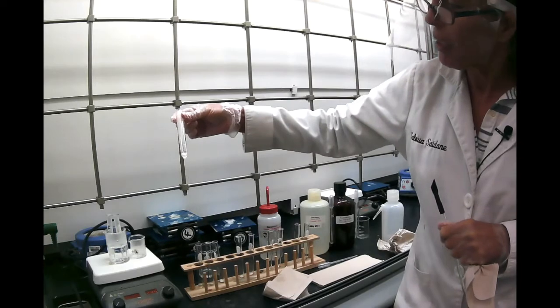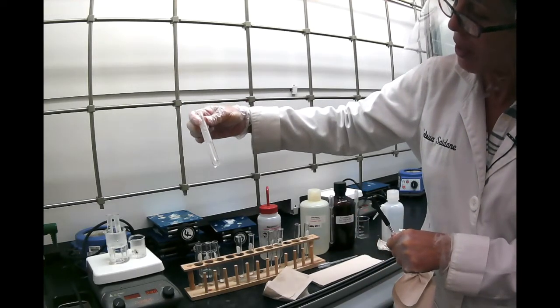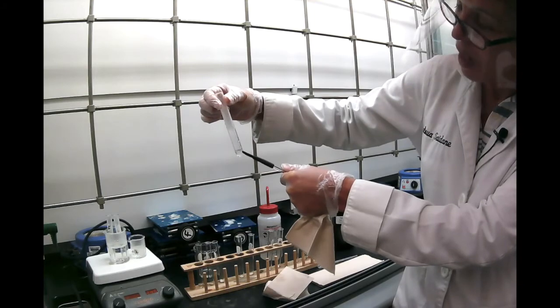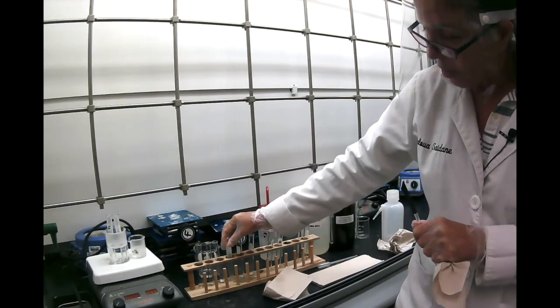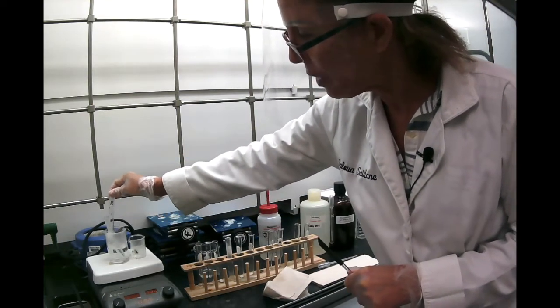So here's the naphthalene, and I don't know if you see it well, but it's oily. It's almost like it melted. It didn't dissolve. It feels like it's accumulating at the bottom here. So naphthalene is not that soluble in hot water. In cold water, it's not at all, and in hot water, maybe a tiny bit, but not really.